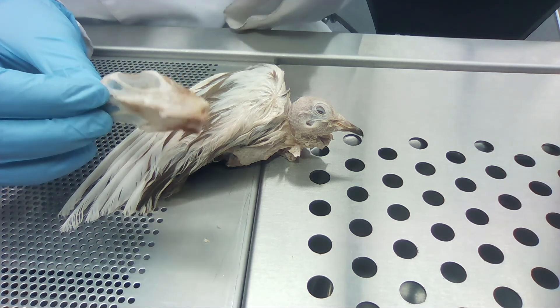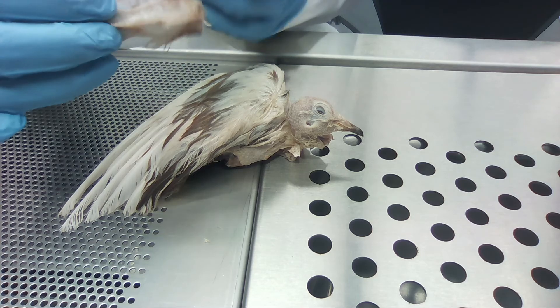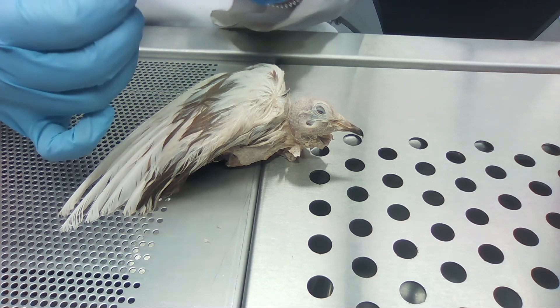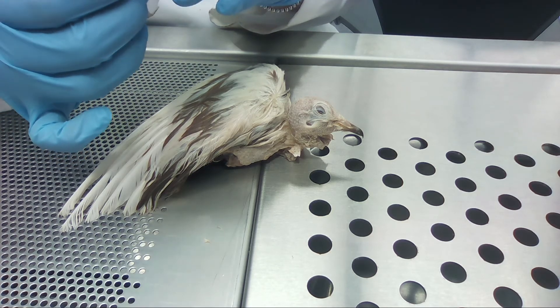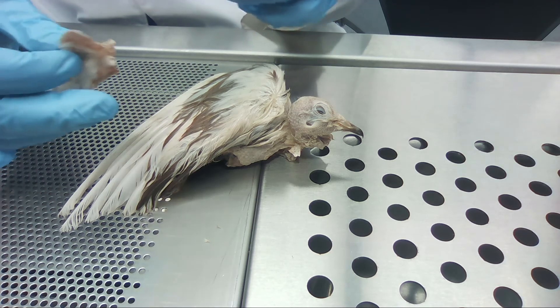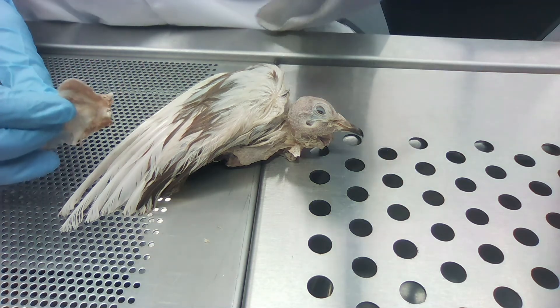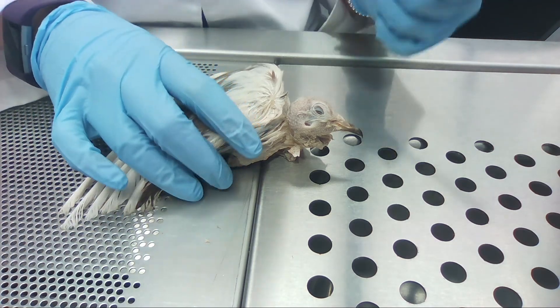Birds have fewer bones than mammals and reptiles because they're fused to make their skeleton more rigid. They also have more cervical vertebrae than any other animal — 13 to 25 — which makes their necks very flexible and helps them preen better. Lastly, they have a fused collarbone called a furcula, or better known to us as a wishbone.